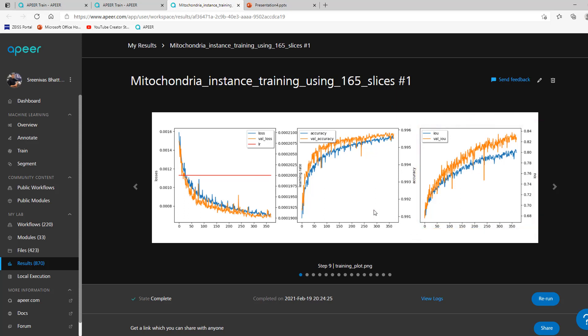These curves may look smooth or bumpy as it depends on the quality and quantity of your training data. Please look at the overall trend rather than occasional jumps between epochs.